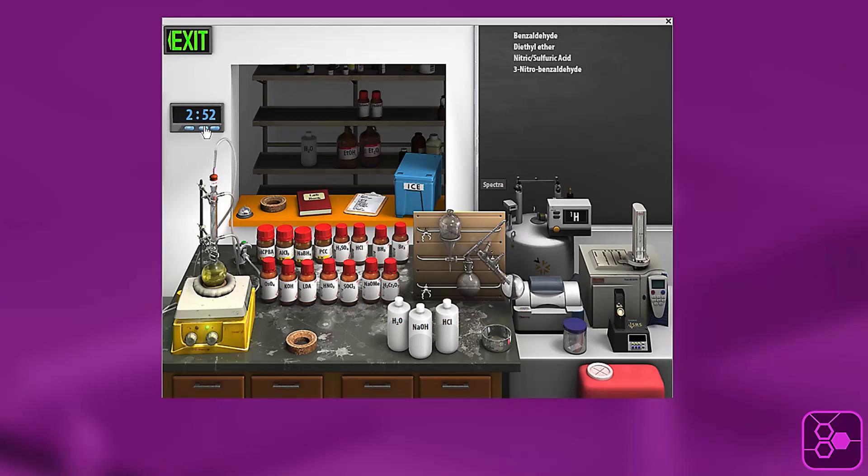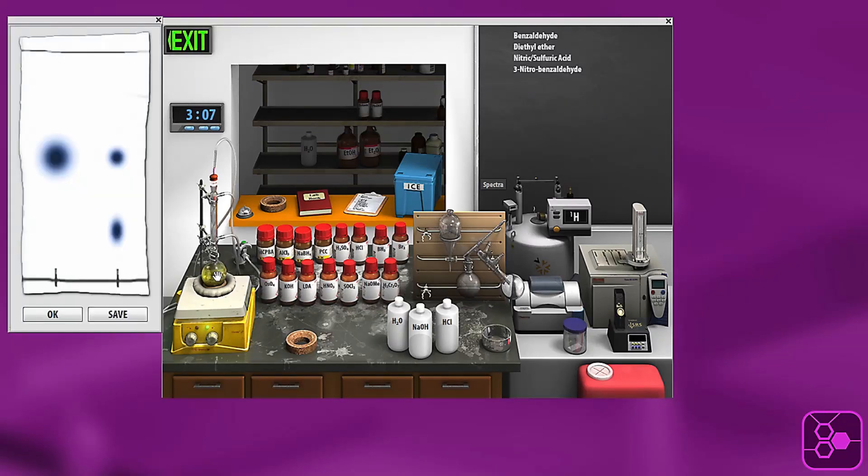If I progress the reaction in half hour bring over another TLC plate. See that now your product spot is getting much larger and your reactant spot is quite a bit smaller.